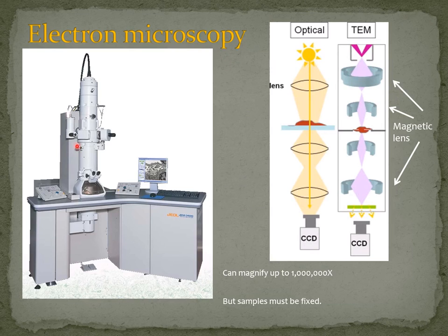And the electron microscope has the cannon of electrons, and we have a schematic here on the right of the slide. So this is actually the scheme of an optical microscope, where we have a light source, we have lenses, we have our sample, we have further lenses to amplify the image, and then a detector, or it could be our own eyes.